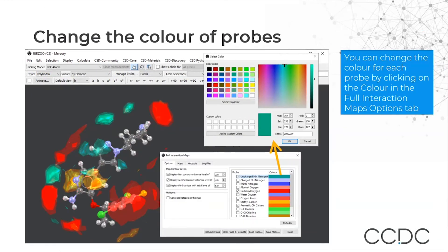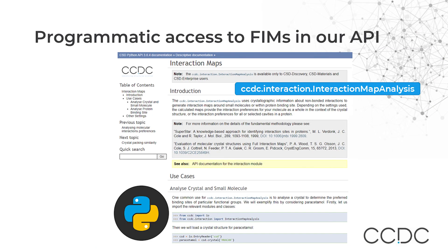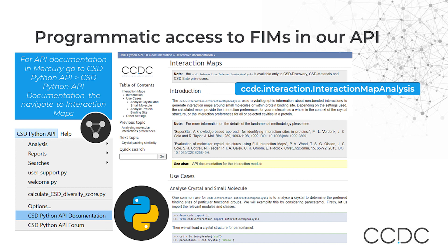The second tip is that you can change the colour of a probe by clicking on the colour listed in the options tab of the full interactions menu, which opens a Select Colour menu. To revert to original colours, just hit Defaults. If you've created a useful full interaction map you want to save, you can save the map in a number of formats using Save Maps on the options tab. You also have programmatic access to interaction maps through the CSD Python API — details on generating FIMs programmatically are in the interaction maps section of the CSD Python API documentation.